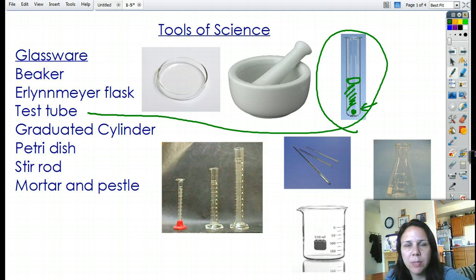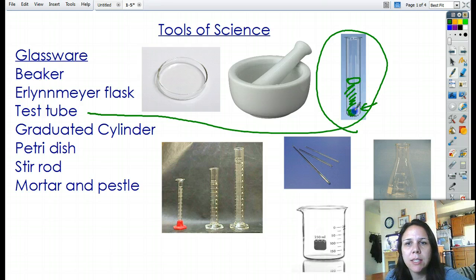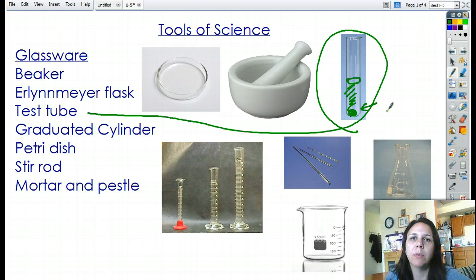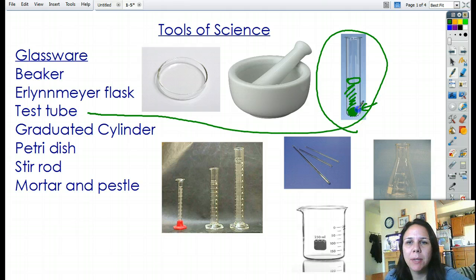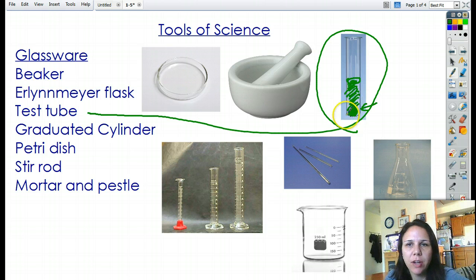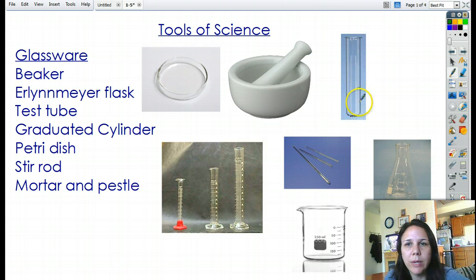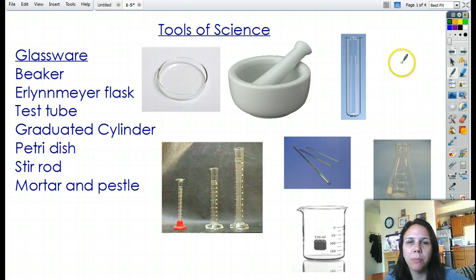In a couple of weeks, when we start learning about organic molecules, one of the things we do is test food items to see if they're composed of proteins, lipids, or carbohydrates by putting them in a test tube and putting some indicator on it to see if they change colors. We have about three or four different sizes of test tubes depending on how big we need them.